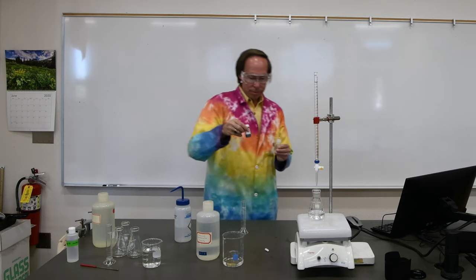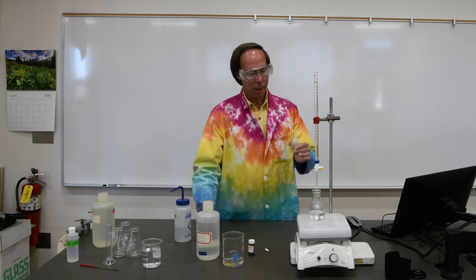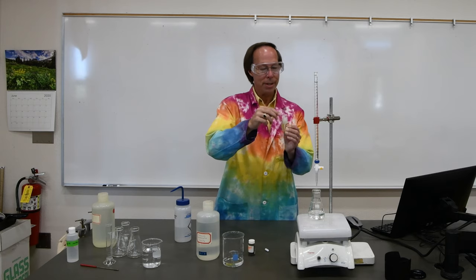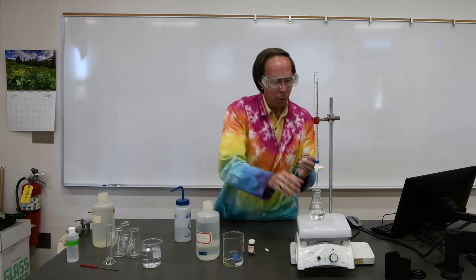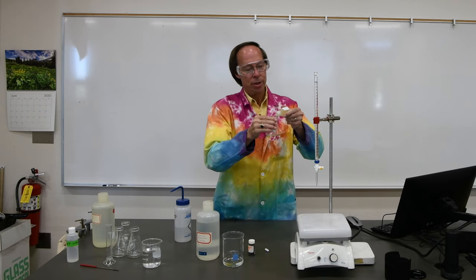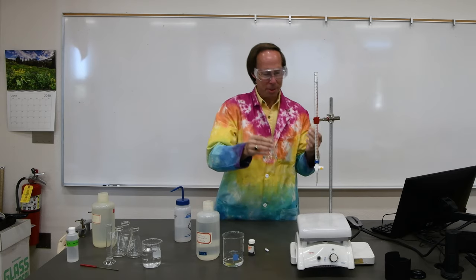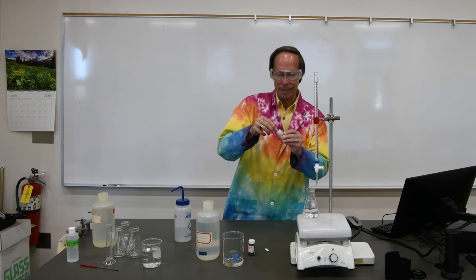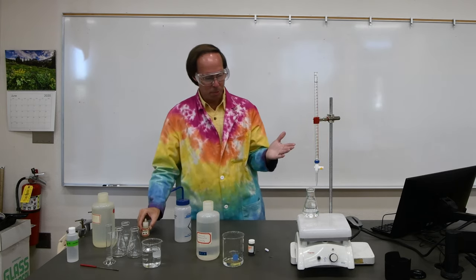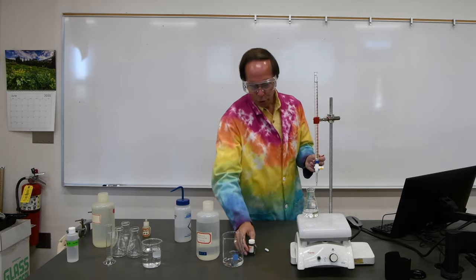This indicator is not very soluble in water. So in order to make the indicator dissolve in water, we're going to add a buffer solution. This is mainly just a solution of ammonia. We're going to add 10 drops of that to adjust the pH. It doesn't have to be exactly 10 drops. If it were 12 or 7, it would still work fine. The key thing is we have to adjust the pH so that our indicator will dissolve.